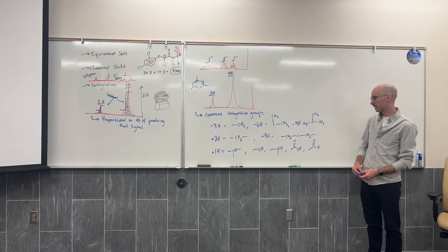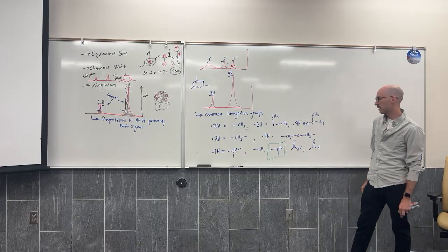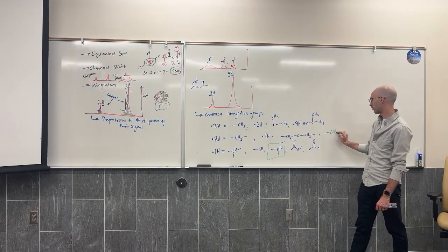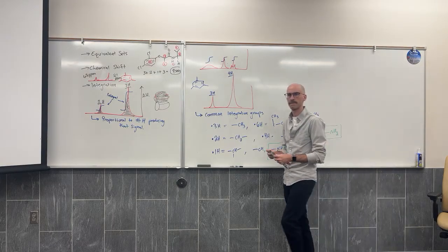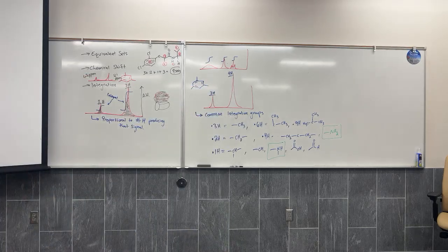Actually, I should add, much like how one H could be from a nitrogen, there is the possibility of 2H coming from a nitrogen as well. Both hydrogens are connected to a nitrogen. They're going to show up as that one signal.